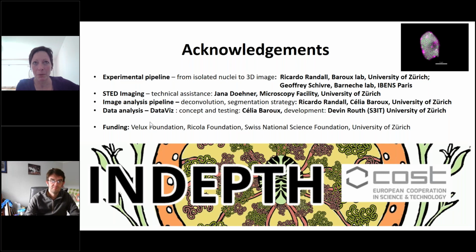Okay, if it's about chromocenters, I think there are other software available which do the job very well, and one of them is nucleus-J version 2 that Christophe Tatou presented a few weeks back. You don't need super resolution, you need just confocal microscopy, and there is a very simple segmentation interface to do this. So I would refer rather to nucleus-J from Christophe Tatou for what you want to do, if I understood the question properly.